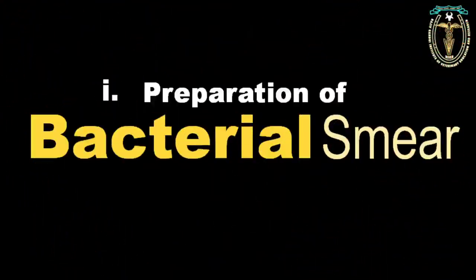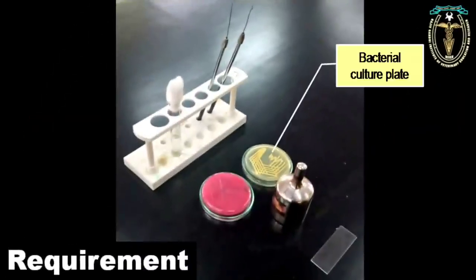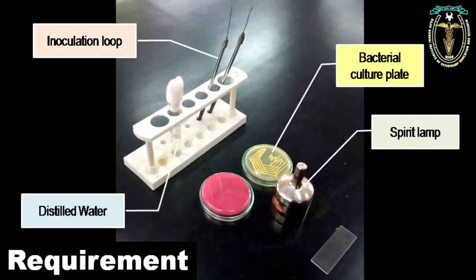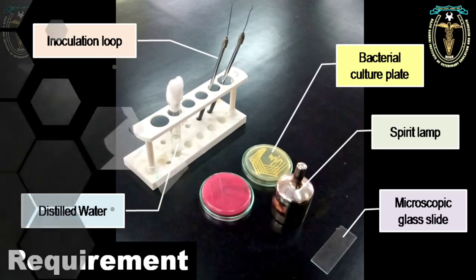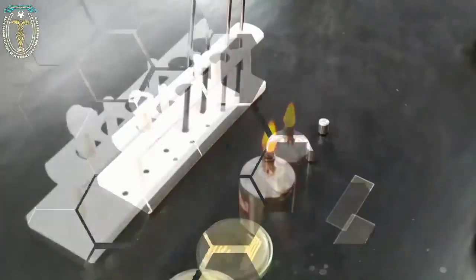The video demonstration. First, we will see about the preparation of the bacterial smear. The materials required are the bacterial culture plate, the inoculation loop, the distilled water, the spirit lamp, and the microscopic glass slide. These are the requirements for preparing the bacterial smear. First, ignite the spirit lamp.